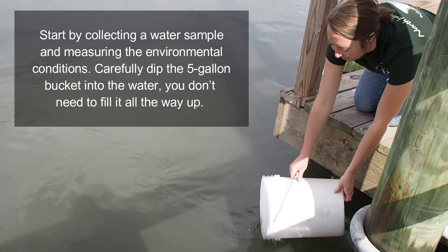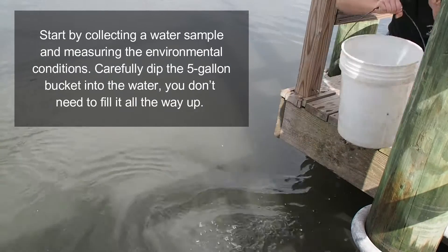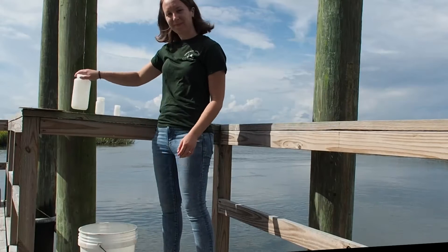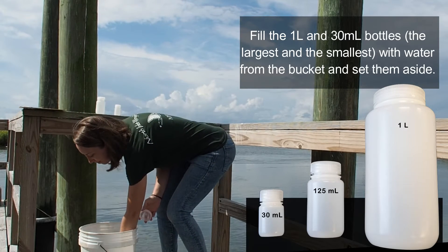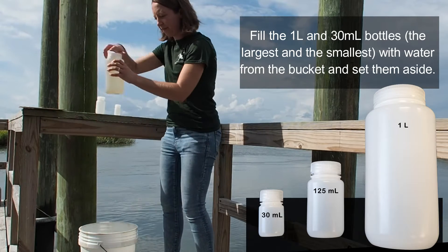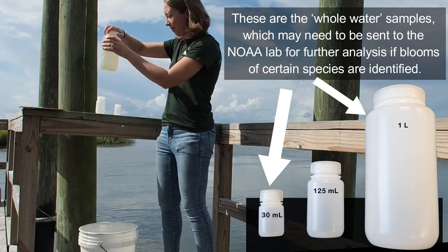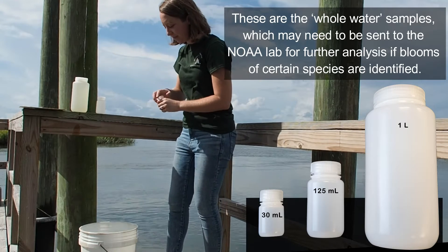Start by collecting a water sample and measuring the environmental conditions. Carefully dip the 5-gallon bucket into the water — you don't need to fill it all the way up. Fill the 1-liter and 30-ml bottles, the largest and the smallest, with water from the bucket and set them aside. These are the whole water samples, which may need to be sent to the NOAA lab for further analysis if blooms of certain species are found.